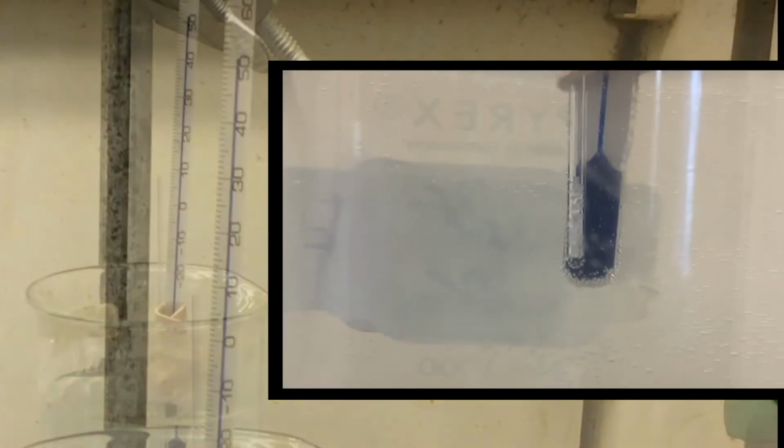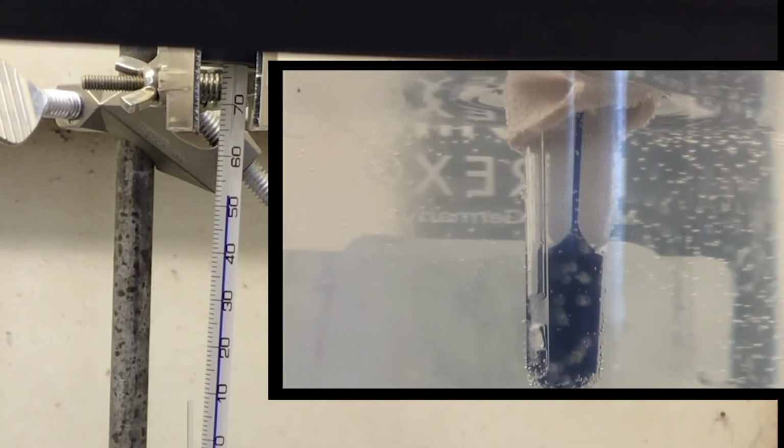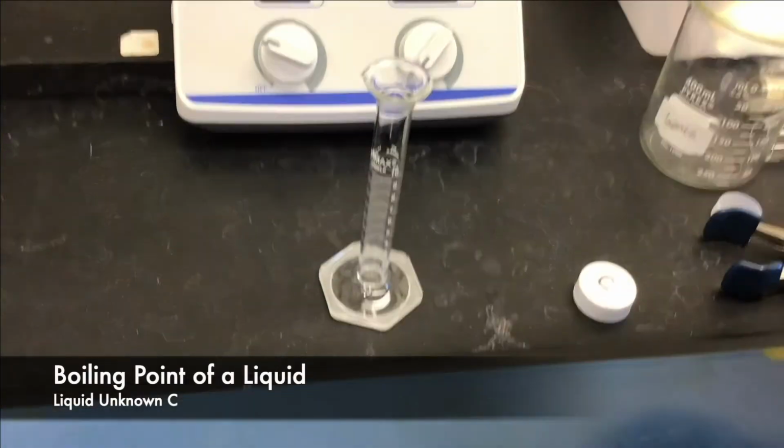At 51 degrees Celsius, we start to see our solid begin to melt. And it's a pretty quick transition from being completely solid to completely melted. We end our measurement at 52.5 degrees Celsius. The last part is part D. We're going to find the boiling point of our unknown liquid C.